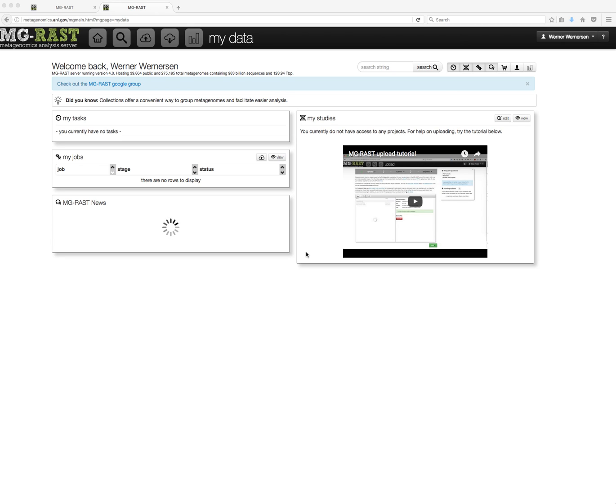Today I would like to tell you about collections in MGRast and how they work. A collection is a static list of datasets that are of interest to you. You can create, edit, and view this list and use it for quick access to those datasets.